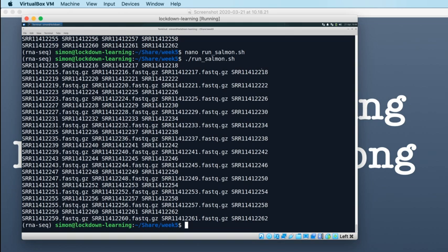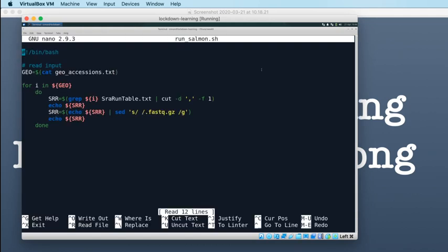So in order to do that, back into our script, we just append it by effectively typing it onto the end. So you do srr equals srr dot fastq.gz, and that adds it on to the end of the whole.